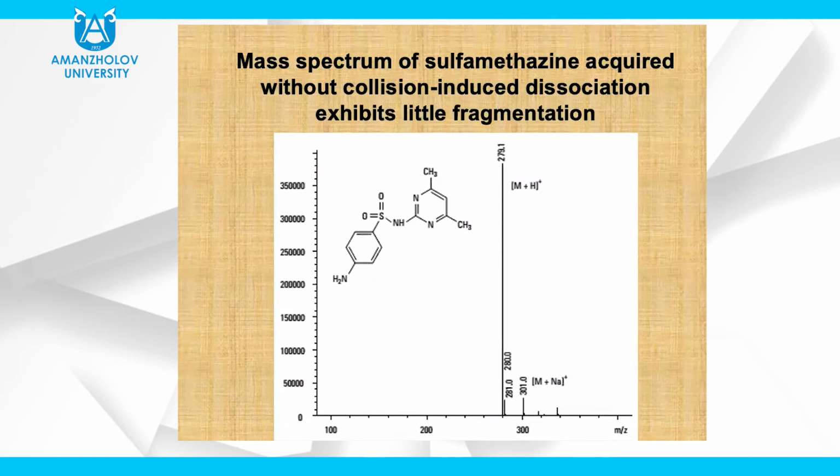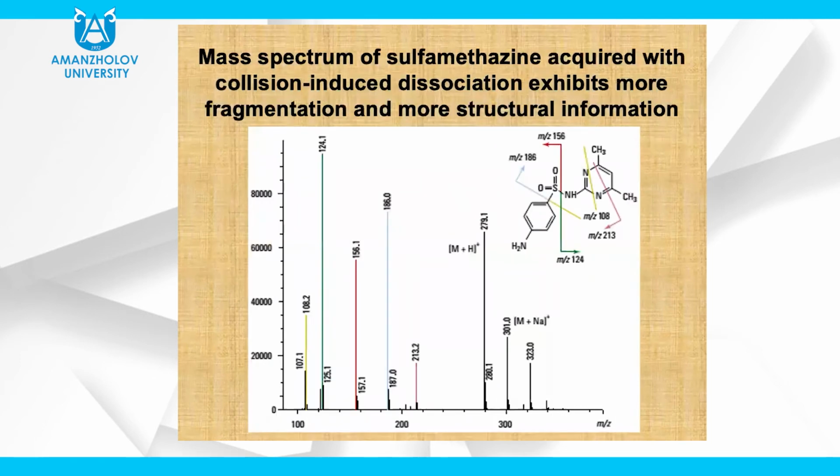Here you can see the mass spectrum of sulfamethazine acquired without collision-induced dissociation, which exhibits little fragmentation. However, when we use collision-induced dissociation, we can exhibit more fragmentation and observe more structural information from the sample.